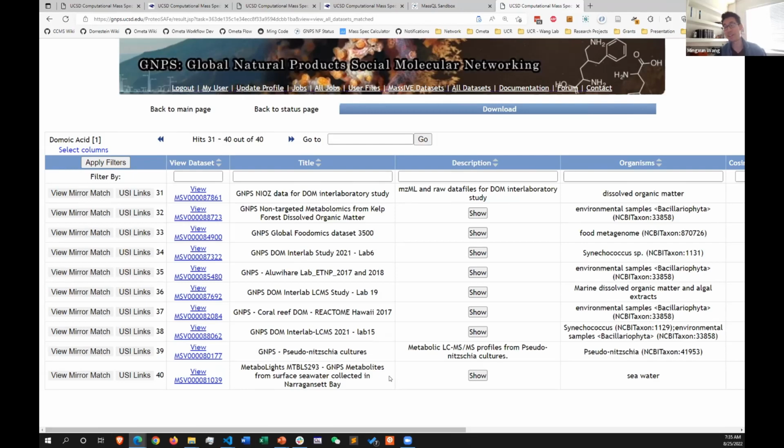And so if you want this kind of capability to search your own data, like your historical data, make it public. It automatically gets thrown into this. So I just think it's very cool. If you have the last 5 years worth of untargeted data, and you want to ask the question, have I, within my own lab, ever seen this analyte before? You can start answering that question pretty easily. But cool. Any questions?